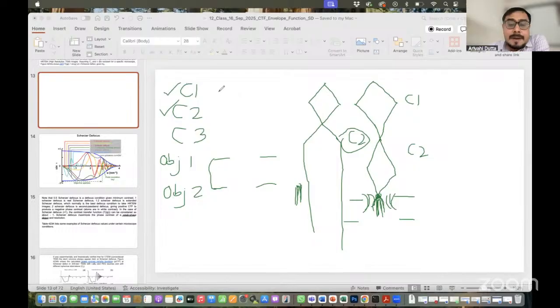Oh, that is a completely different thing, because whatever first question you asked me, sir, how you are making the beam parallel, I am telling you that there are two ways to make the beam parallel.